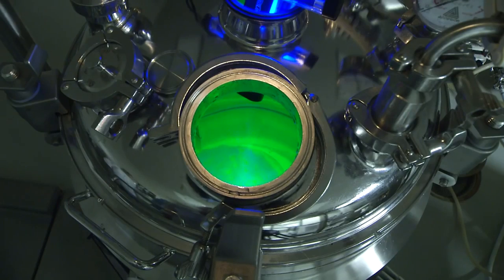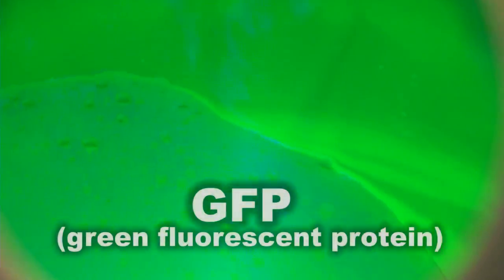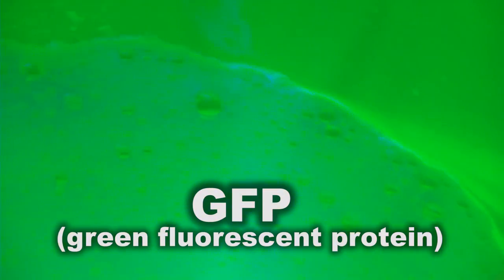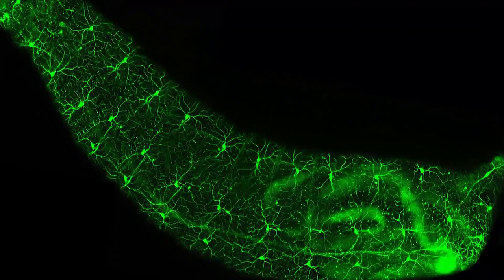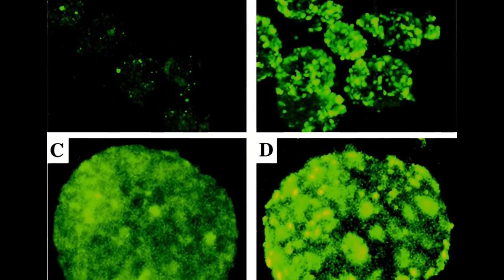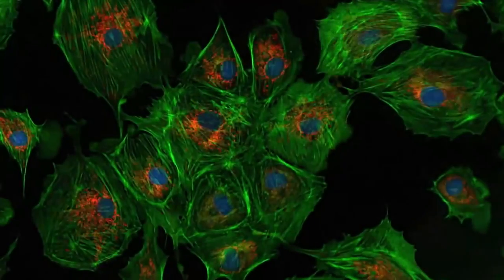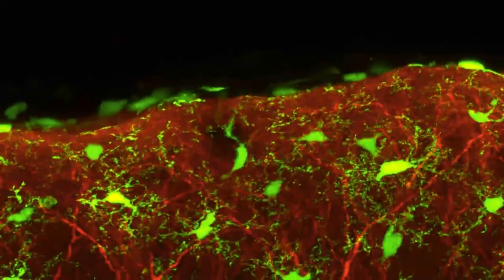In this program, we are going to look at a typical recovery process used in the manufacture of GFP, green fluorescent protein. GFP is broadly used as a biological marker, which, if attached to a drug, could provide researchers with a visual story of where the drug goes. It's a fluorescent dye that's very well tolerated by most cells and doesn't interfere with normal cellular function.